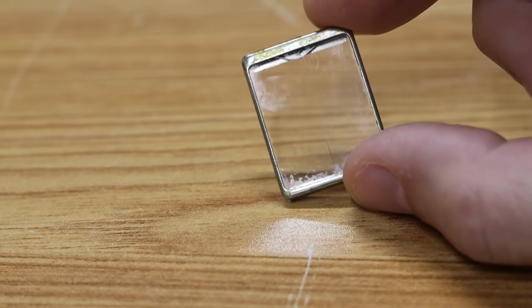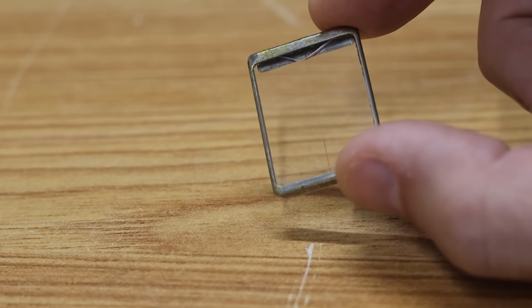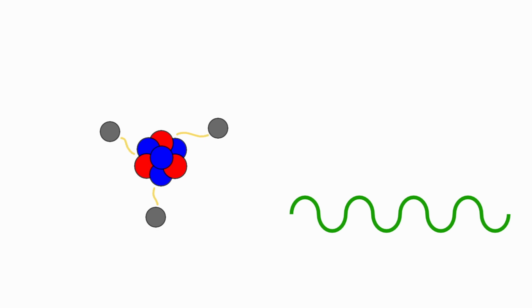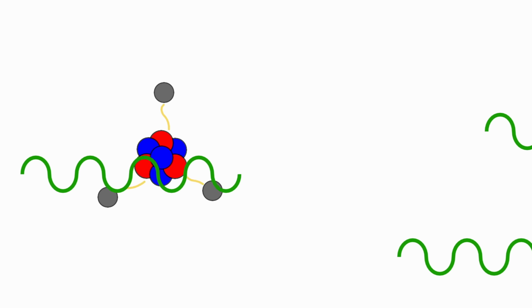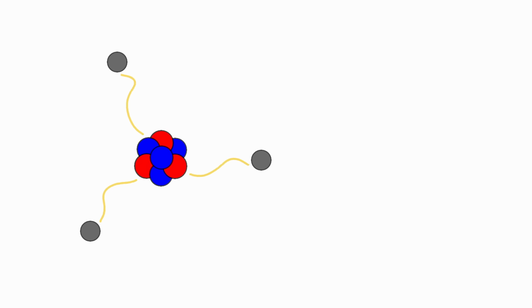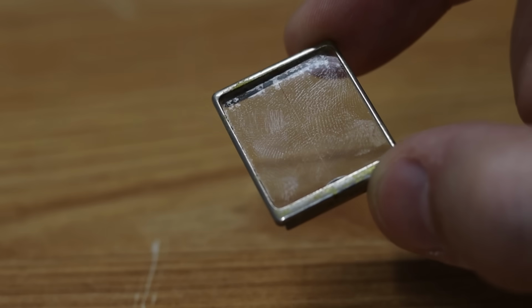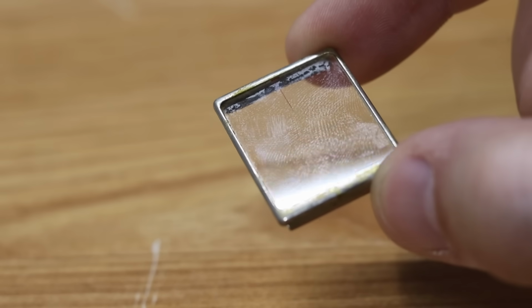Now, in the case of transmission, like this little piece of glass right here, the electromagnetic radiation from the lights doesn't actually interfere or interact with the electromagnetic forces that are binding the electrons to the nuclei in this substance. And because it doesn't interact with it, it passes right on by as if nothing happened, comes out the backside, and transmits almost perfectly to the other end. Now, the real world is dirty and not perfect, and this glass has all sorts of smudges and marks and whatnot on it that are actually catching a little bit of that light.